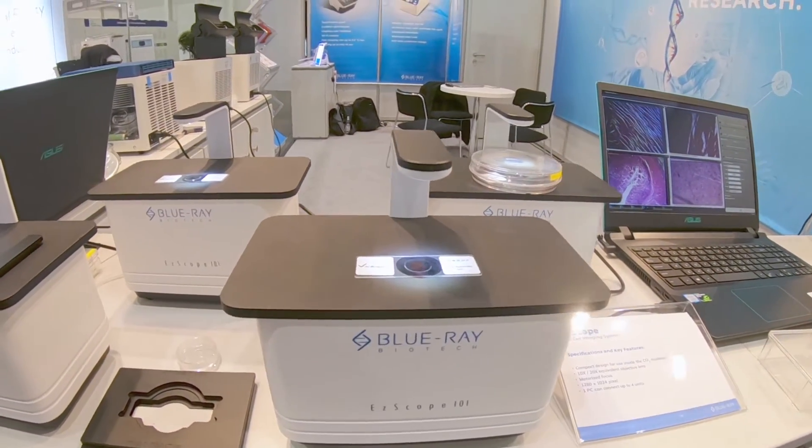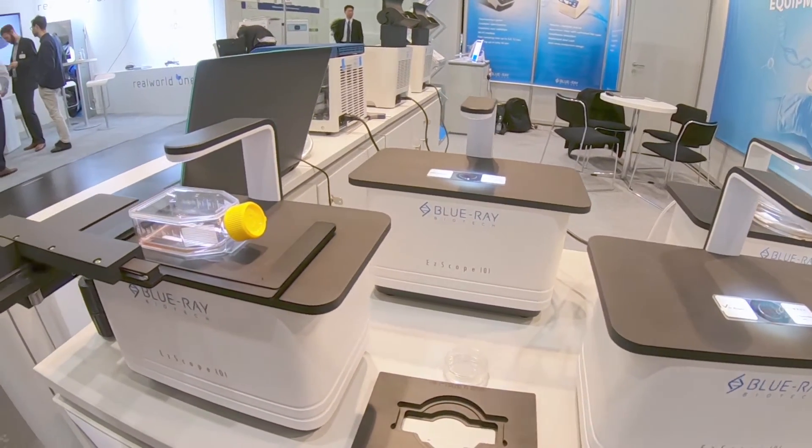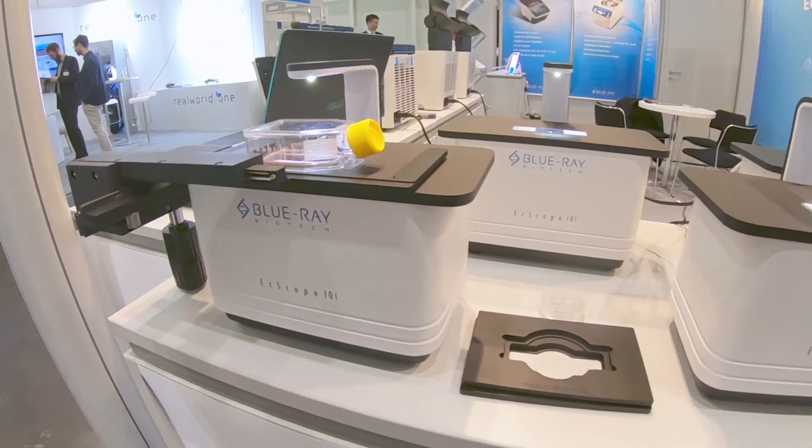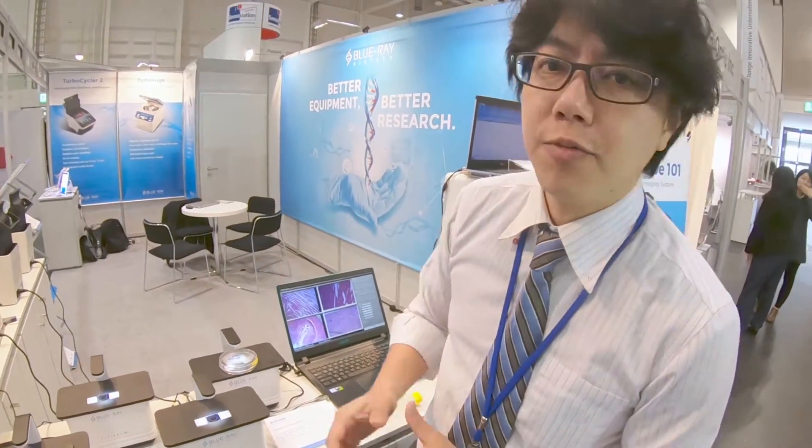We also have a confluence function inside, so the customer can check the cell culture density. This is our new product I'd like to introduce to you. If you are interested, please view more information on our website or contact me directly. Thank you.